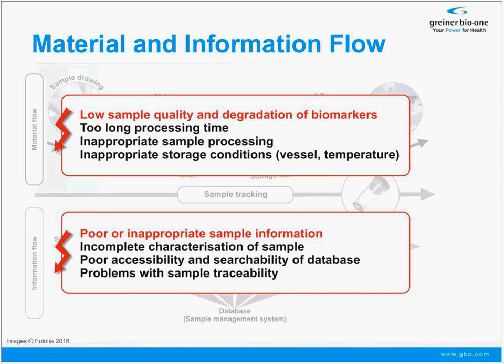There can also be poor accessibility and searchability of the info in your database, which makes your approach very unattractive for end users because they want to get rather comprehensive information about the samples you have. And finally, there can be problems with sample traceability, and this is an absolute problem because if you cannot trace your sample anymore, then it's actually lost and gone.